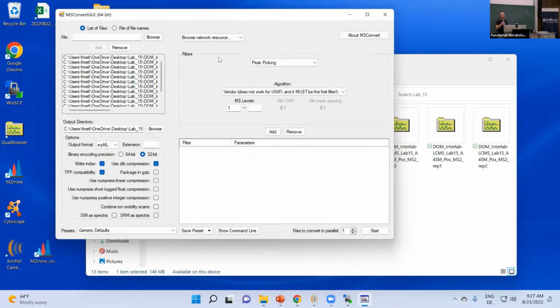So what centroiding does, right, is if you have, let's say, a peak here, it will pick the top of the peak. Now, I don't fully understand what's going on under the hood, but what we observed was that the CWT algorithm, instead of picking the middle here, just picks exactly the highest data point.